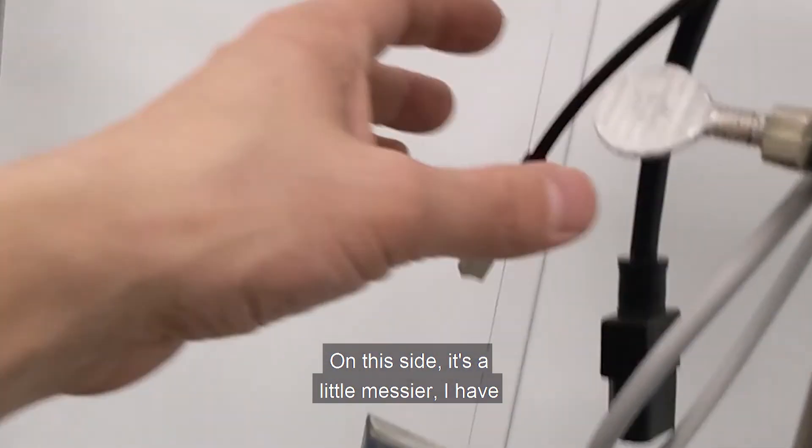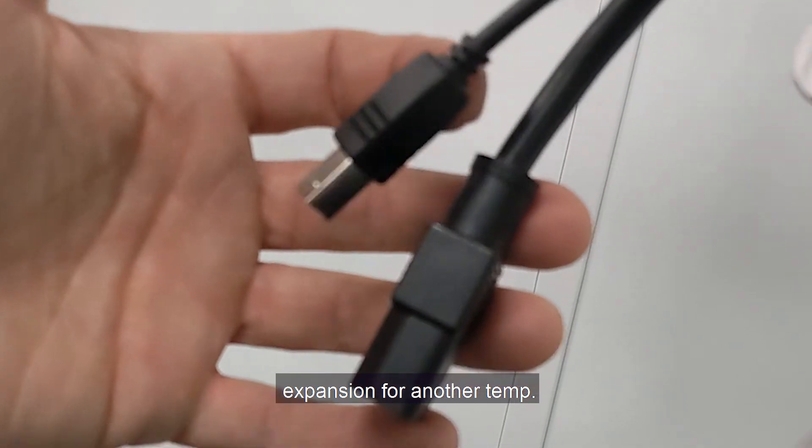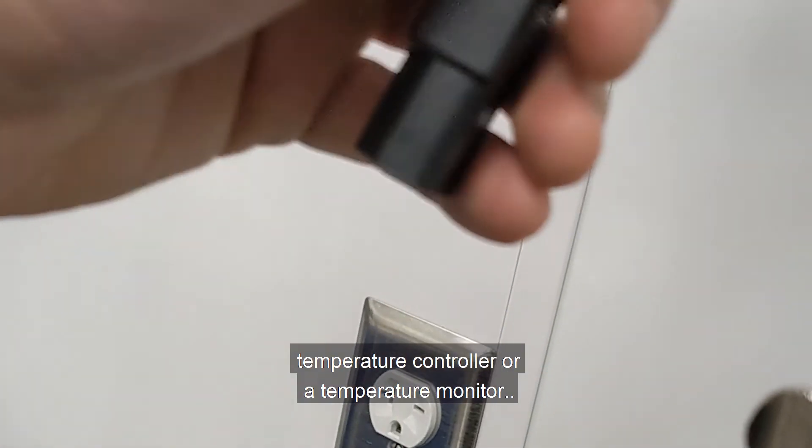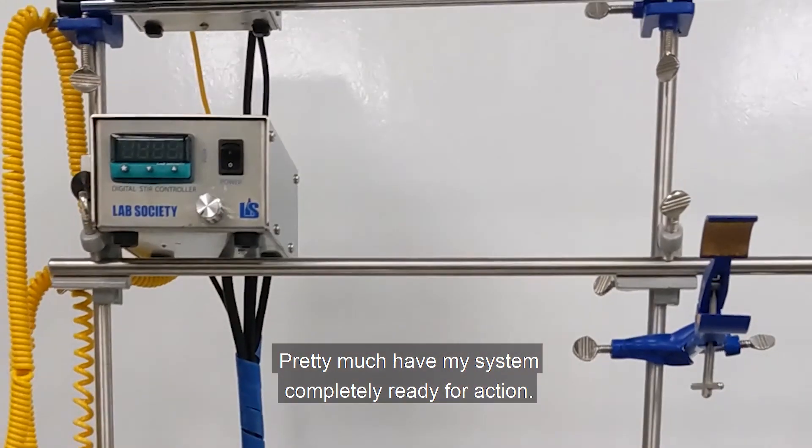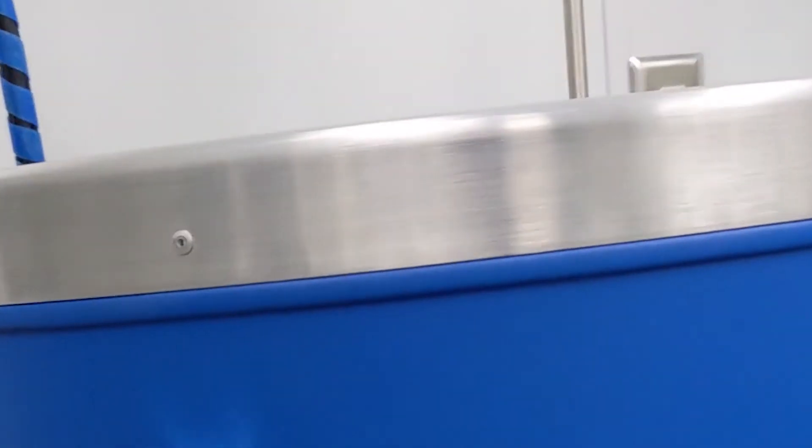On this side, it's a little messier. I have expansion for another temp controller if I'd like, so either a dual-channel temperature controller or a temperature monitor. All the USBs are both right here and then across the table. Pretty much have my system completely ready for action.